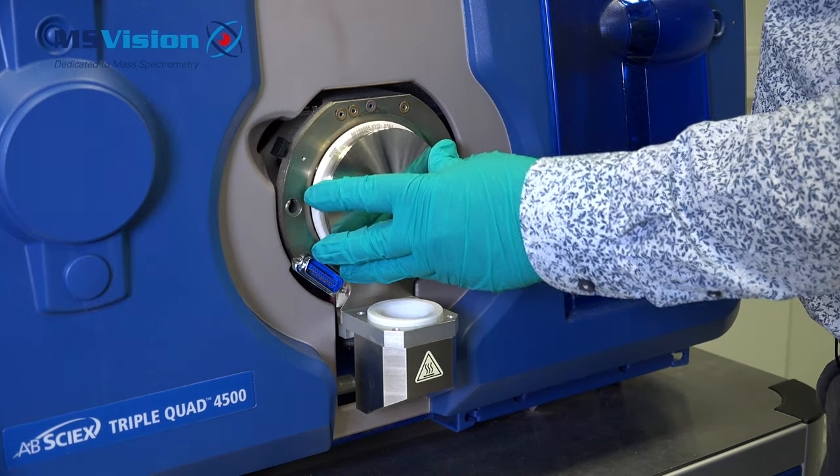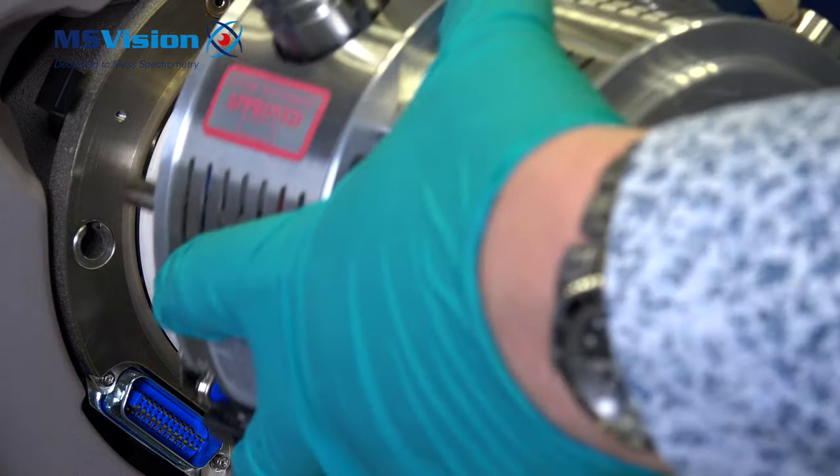To replace it, gently push the plate back on, trying to keep it level, then replace the source.